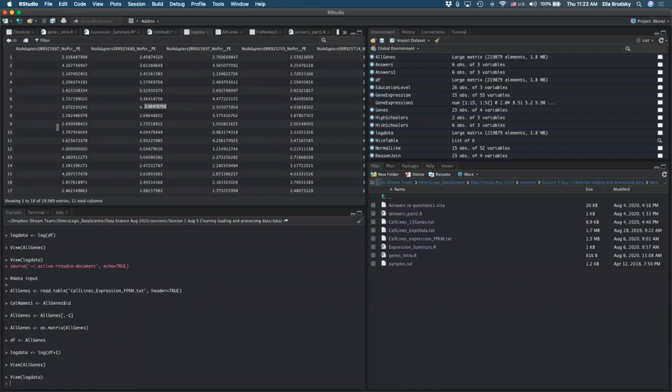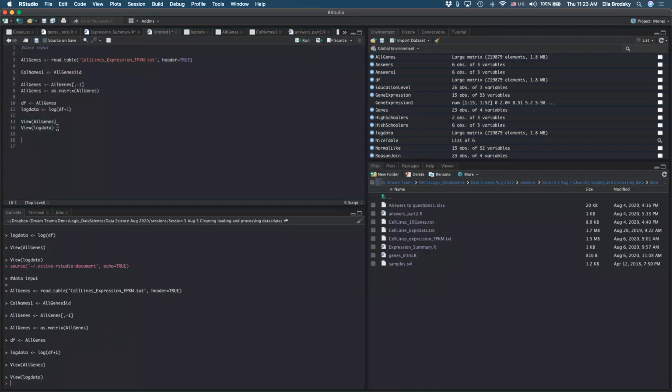What do we want to do with this data? Let's do a box plot, right? So let's do a summary statistic actually first before we start going into visualization. How do we do summary statistics? We just type summary. And let's do summary of log data. And we don't need to view these anymore.